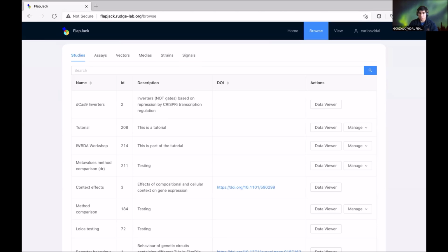I made this analysis, you make this, and you are using different analysis as well. Like, I get this data using this analysis, and you get this other result on the same data using the other analysis. Let's see what happens. That's more or less the platform that we want to build.